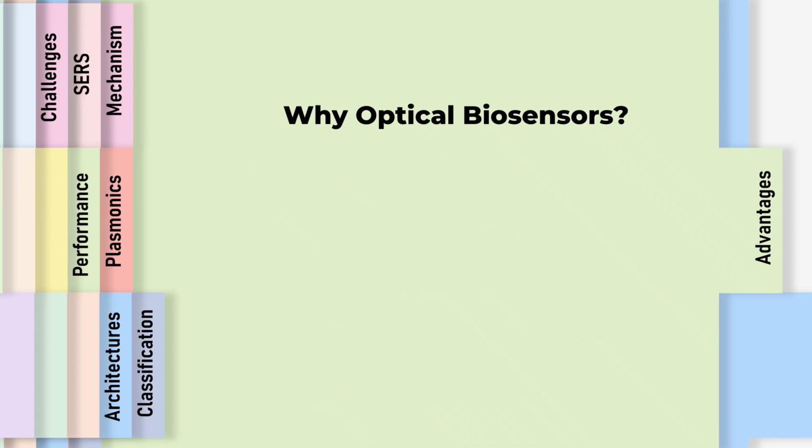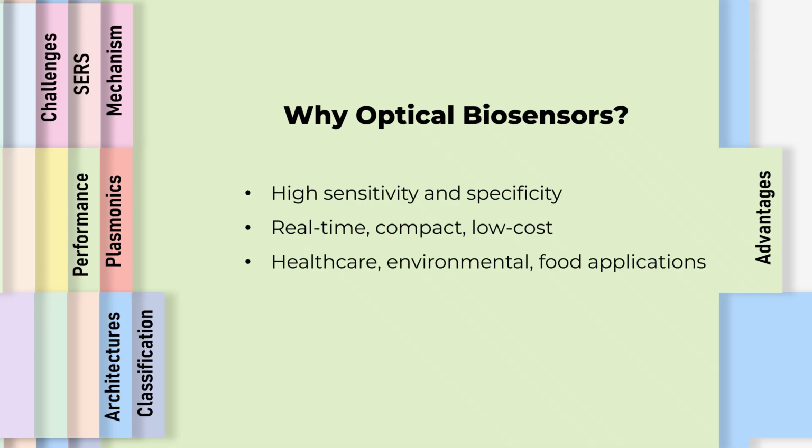Optical biosensors are widely used because they offer high specificity and sensitivity. They allow real-time and continuous monitoring. They are small in size and cost-effective. These advantages make them useful in healthcare diagnostics, environmental monitoring, and food safety.